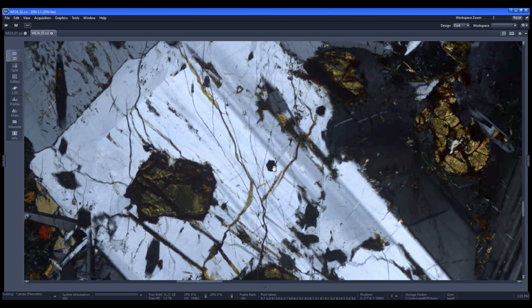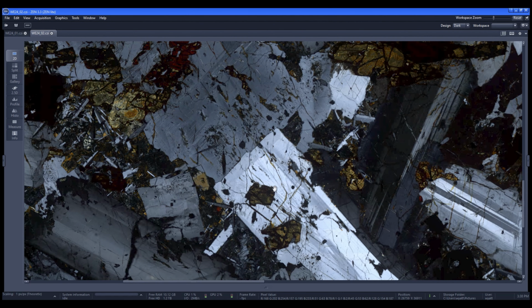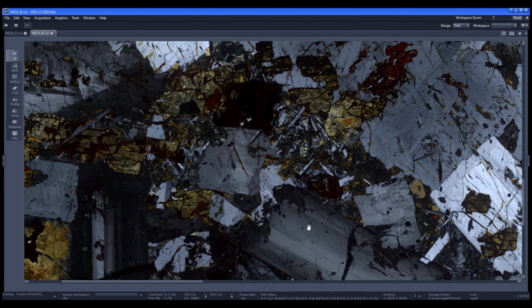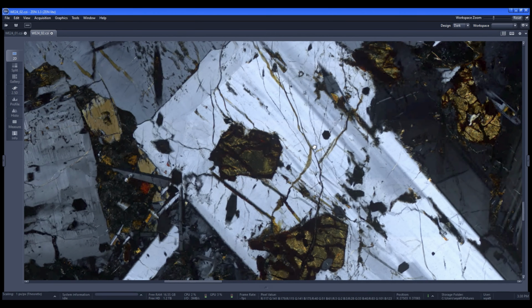And I'm sorry if I'm throwing all kinds of scientific jargon into this video. I know all these terms, you probably have no idea what's happening, but I hope you're at least appreciating the pretty imagery here in these thin sections and all the cool minerals. So again, I am not an expert myself. I'm still learning. So when it comes to mineralogy and petrology, I still have a lot to learn myself, but hopefully I can share some cool things with you and maybe you'll learn something, even if I don't fully explain myself.